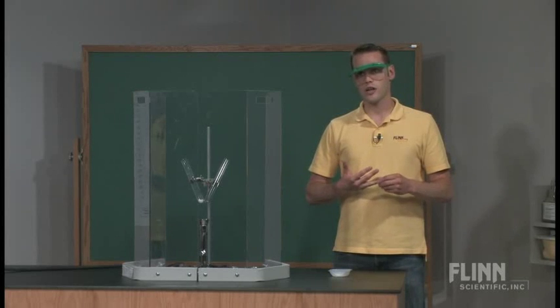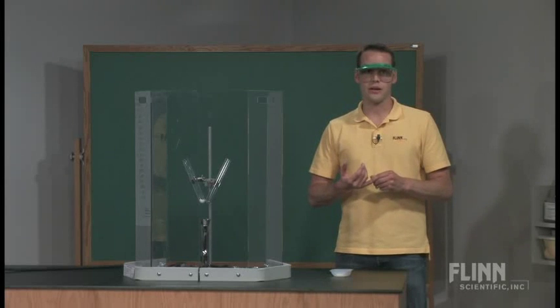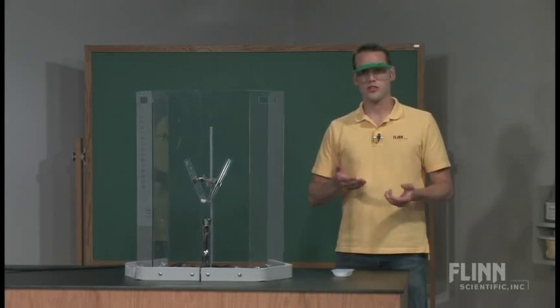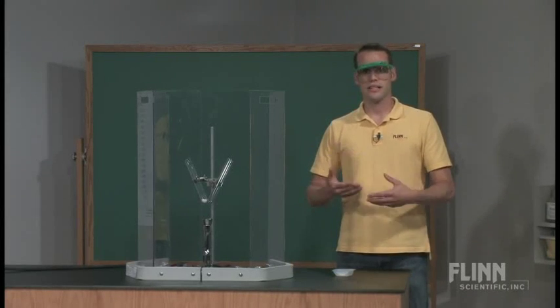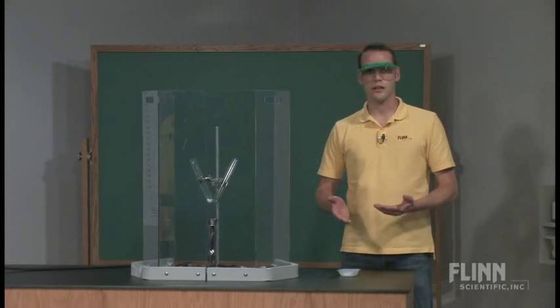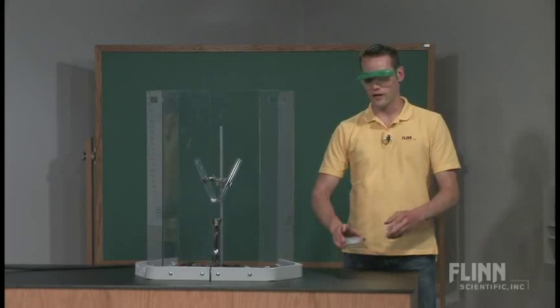Potassium chlorate and sodium chlorate in contact with anything that contains carbon can create some kind of reaction. So rubber stoppers, candy, the rubber soles of your shoes if some of it falls on the floor. Potassium chlorate needs to be measured out onto a surface that's clean, and you need to make sure you clean it up afterward and that you don't treat this carelessly. This is something to be very cautious with.